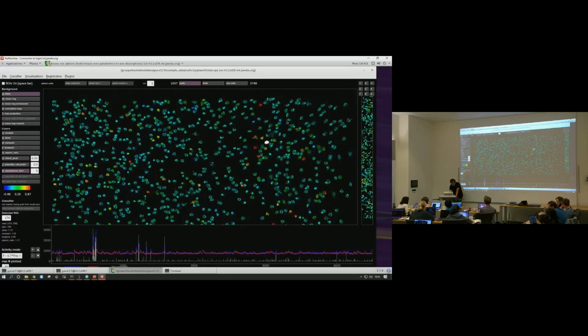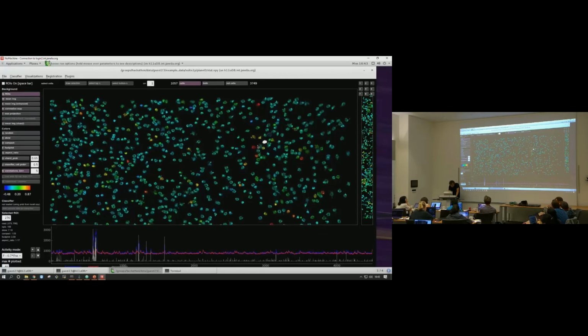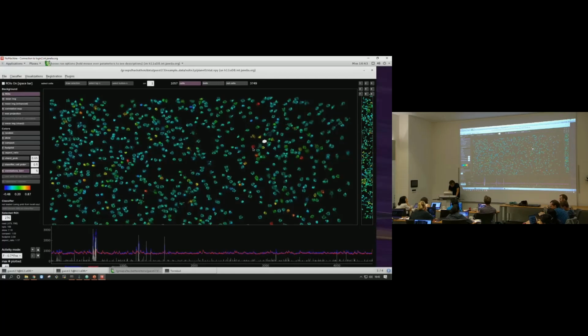Now, you can do other things like start grouping cells together. If I have a bunch of cells that are highly correlated, why don't I just start to select them, one after the other. Or you can select the top 10, but it looks like the shortcut isn't going through.